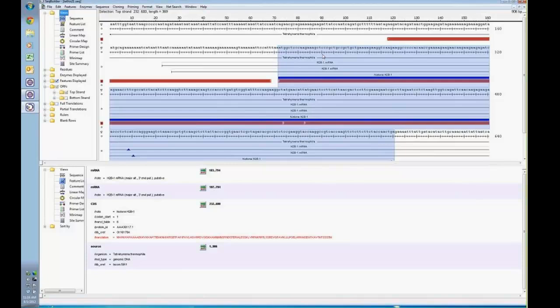So what we've done here with this target is, one, we've evaluated whether there are any rare codons within this target that will affect my downstream expression of this target. So we've optimized for codon usage. Another thing is, we've looked at the open reading frame and made sure that what we have listed as a feature here is actually in frame with that initiating methionine.